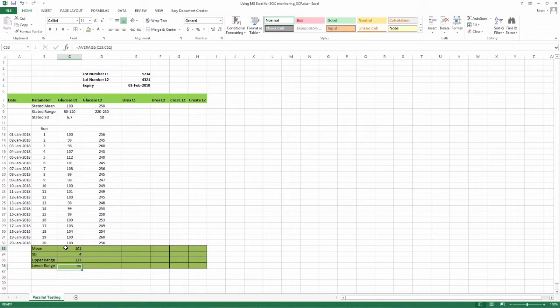You can now drag the formula to automatically calculate the mean, SD, upper and lower limits of all analytes by doing this. Select all the 4 rows where we have inserted the formula. Go to the bottom right where a plus sign appears. Keep the cursor pressed and drag this plus along the bottom of the last row to wherever you have fed your inputs. Your values for mean, SD, upper and lower limits of all analytes appear.